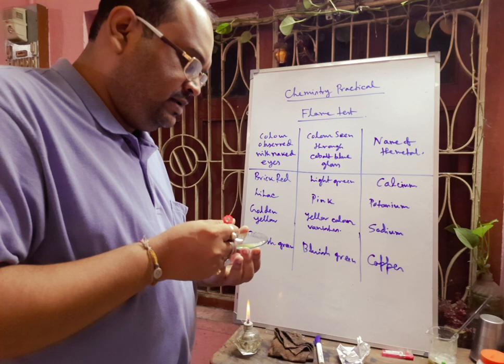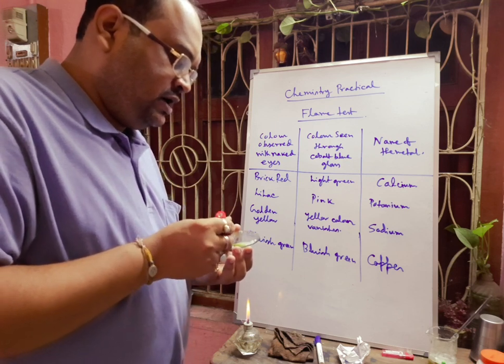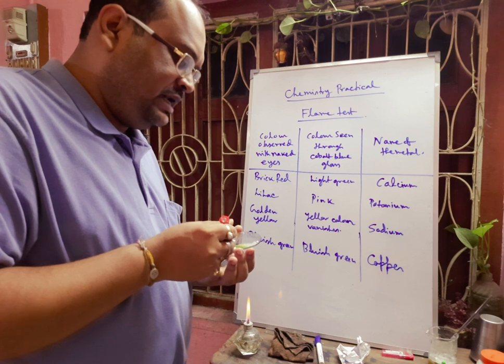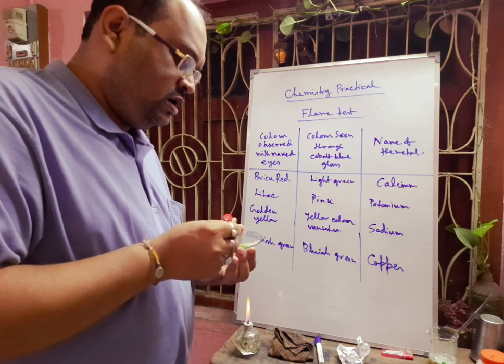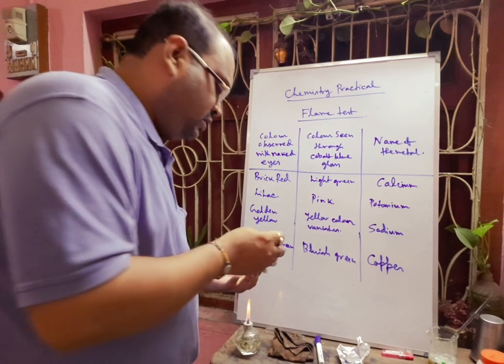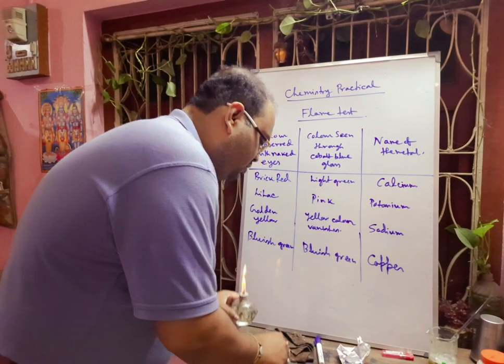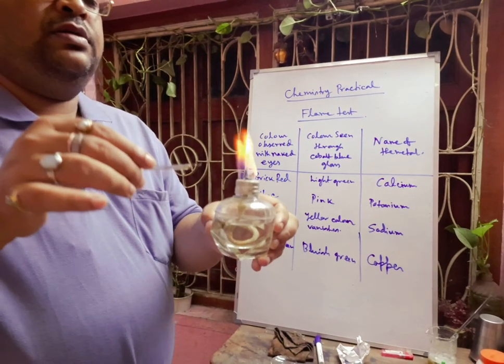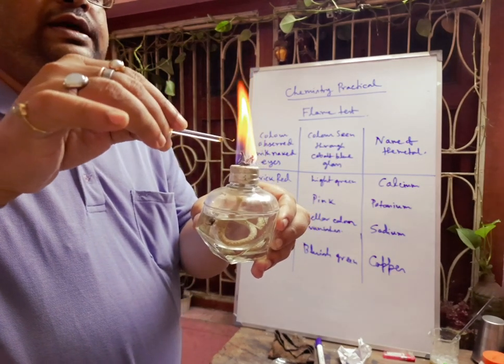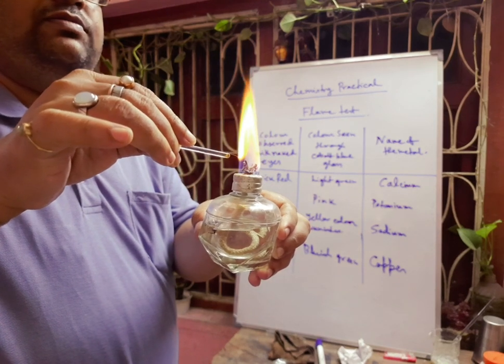Sometimes, if platinum wire is not available, you can do the test using copper wire as well. I am using copper wire — taking some copper salt again — and you will see the bluish-green color.